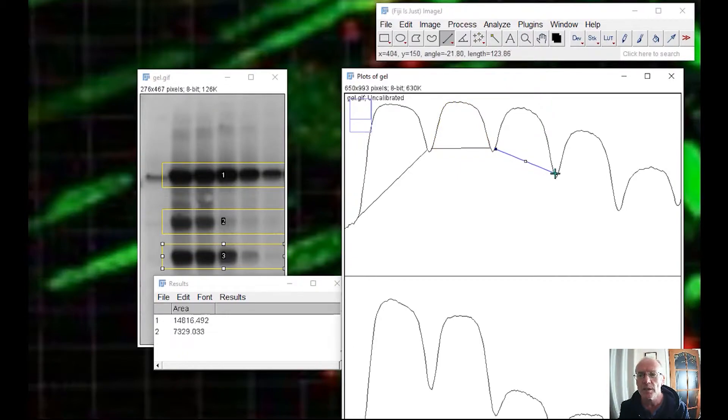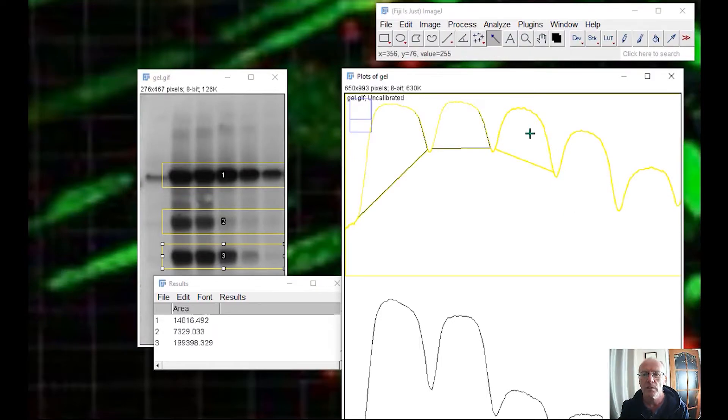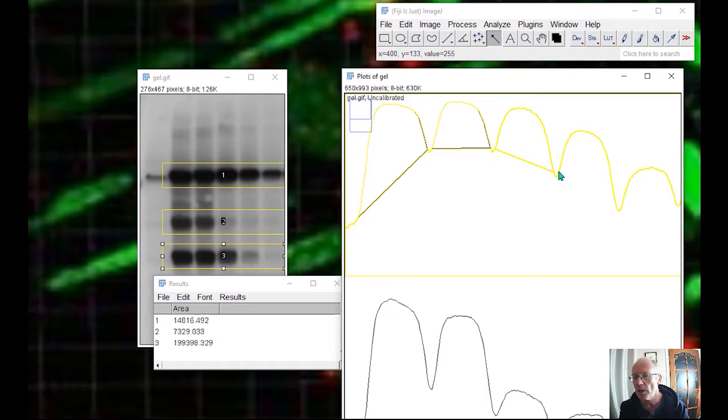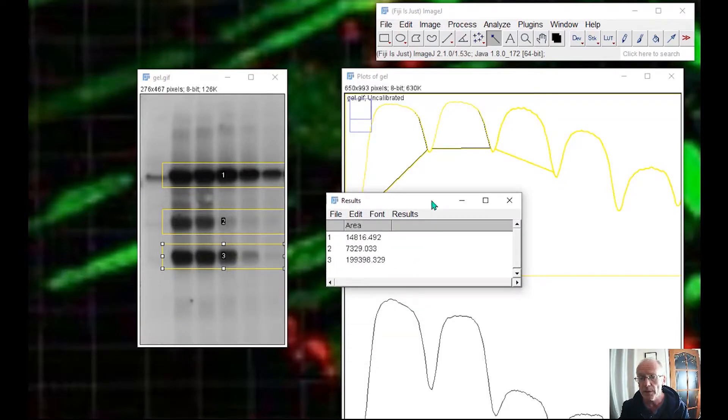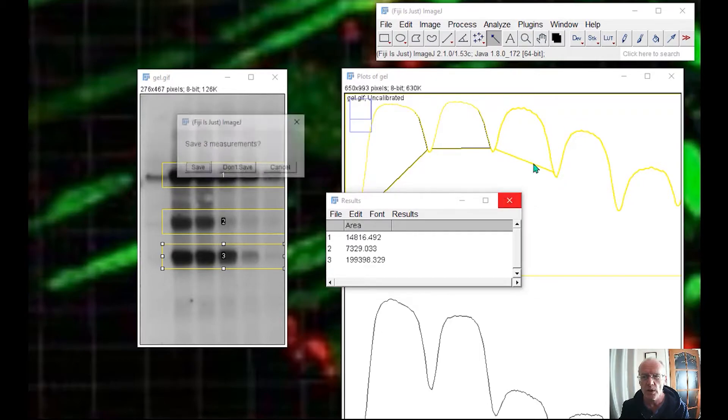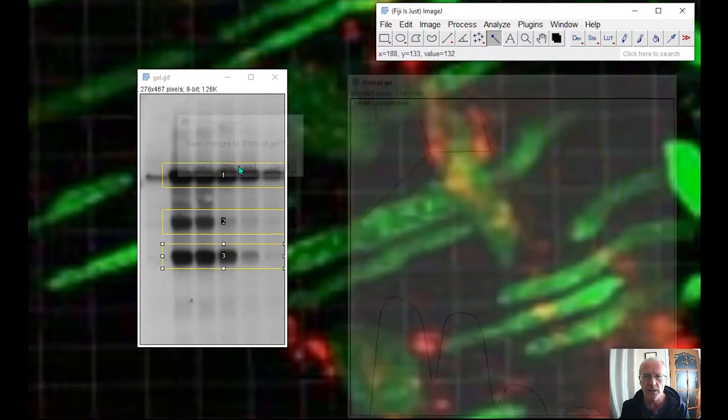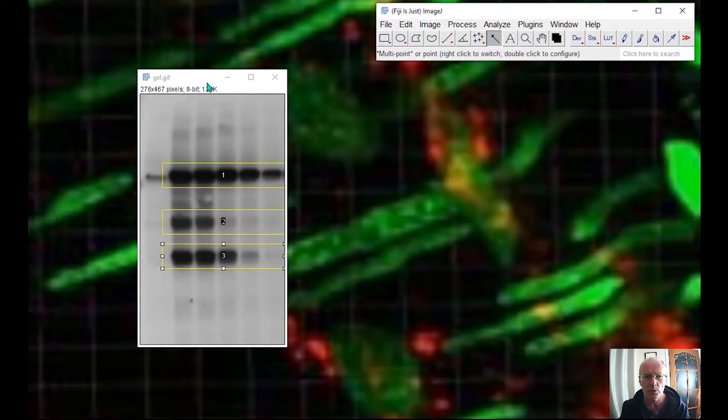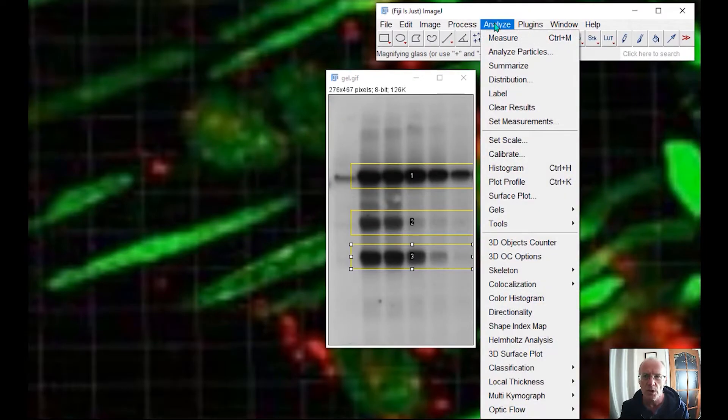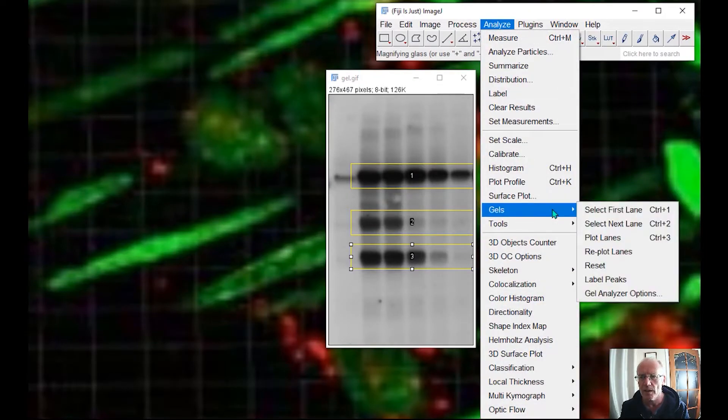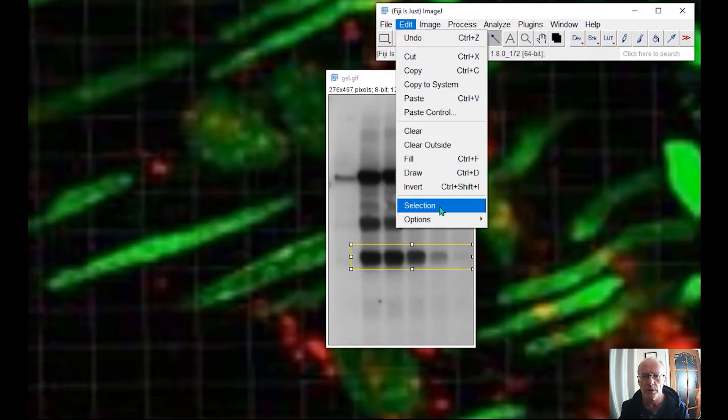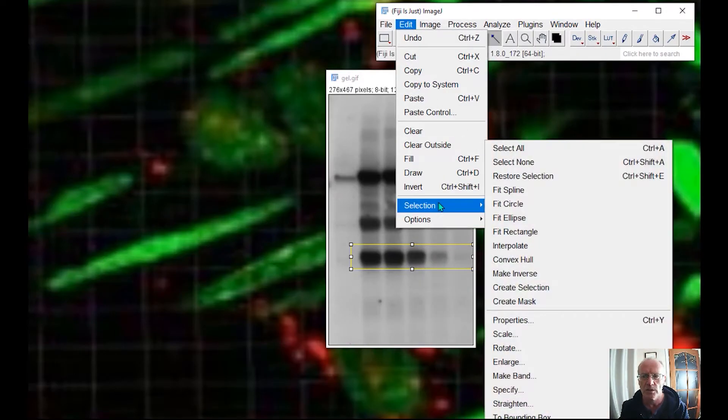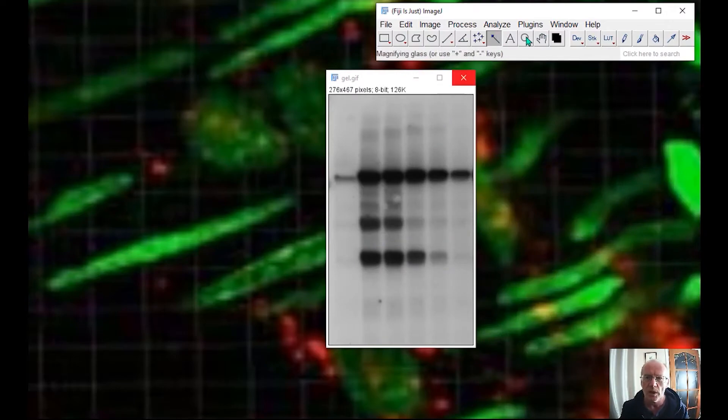Seems to me there's kind of, well it's a bit subjective. It depends on how you draw these lines. That one's far too big. Anyway, so you get the point. That's how the gel tool works. It's not the way I would have thought to do it. And as I say, I don't do this type of analysis. So I'm curious to hear what others think. I'm going to reset this. I need to get rid of this one. So that'll be under selections. Select none.